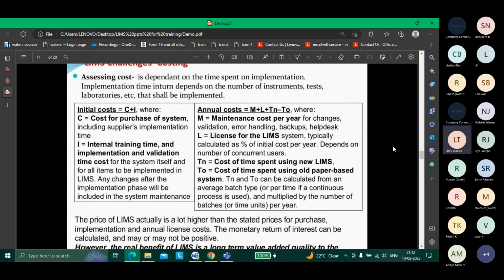Okay, next question. Sir, this is Bhaskar. Sir, actually, I'm a microbiologist. I have LabLIMS access. I'm at analyst level. Okay, good. For analyst level LabLIMS users, they will not have access to all modes. Some modes will not open for us. You will have very limited access.